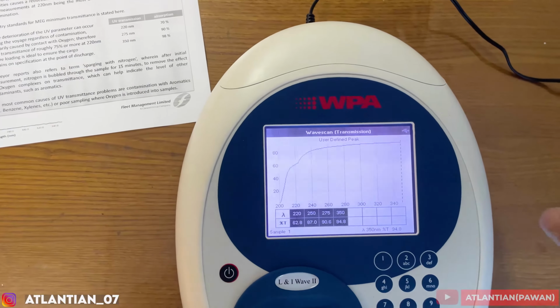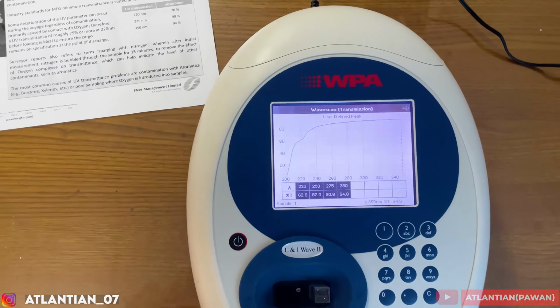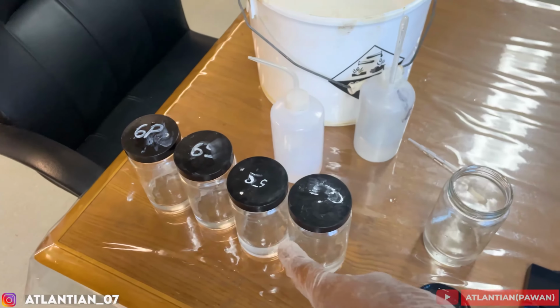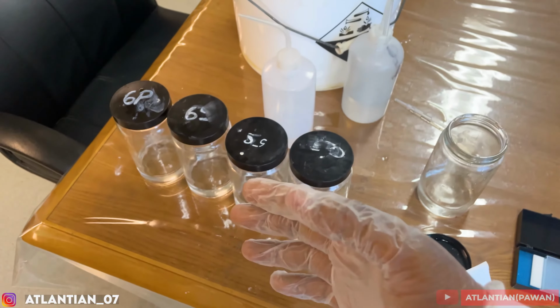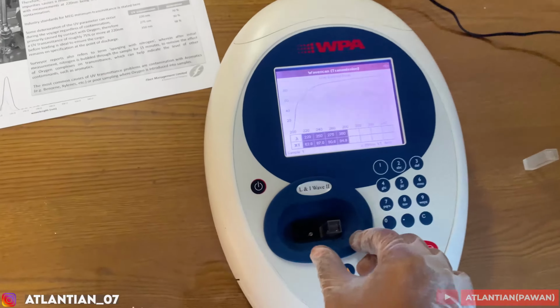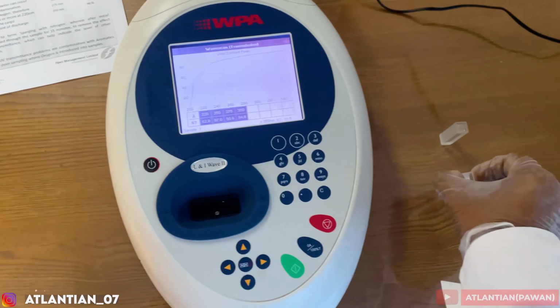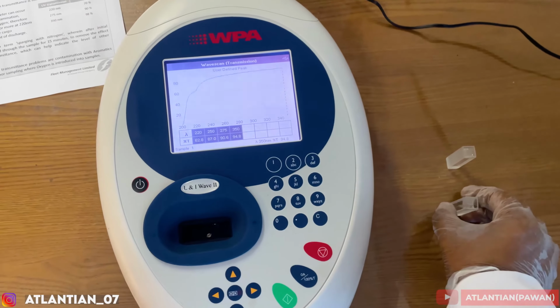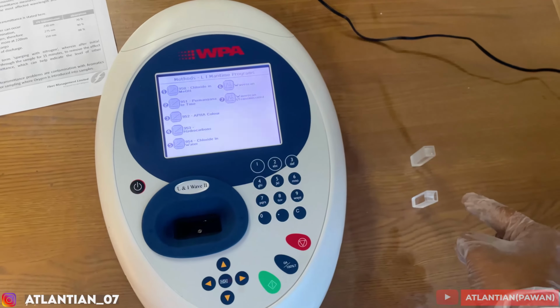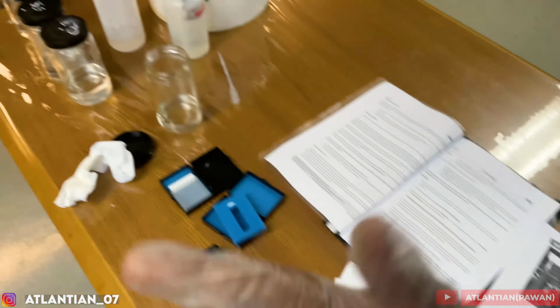This is what we'll keep on doing every 3 to 4 days for every tank which we have loaded. That's why I've taken the other samples as well, and the same thing I'll be doing for the other tanks also. So I'll take it out, record this in my paper, come back, wash the glass and repeat this with the other tanks.